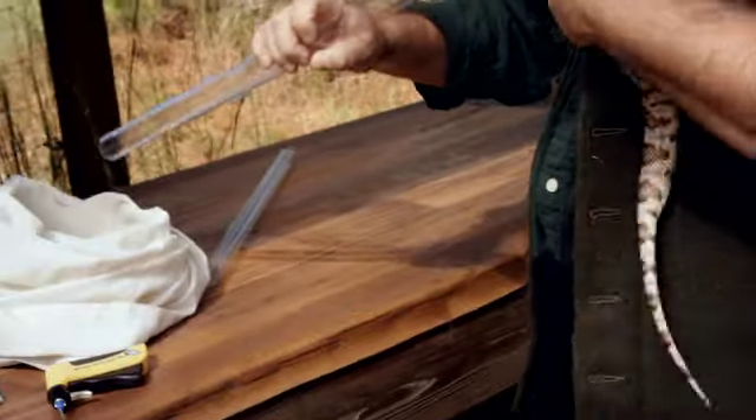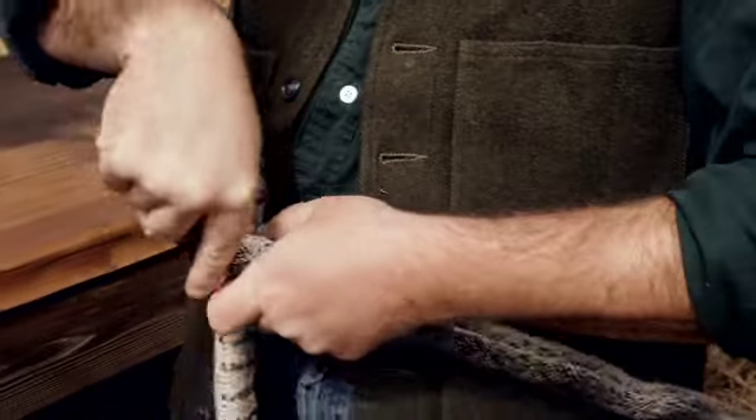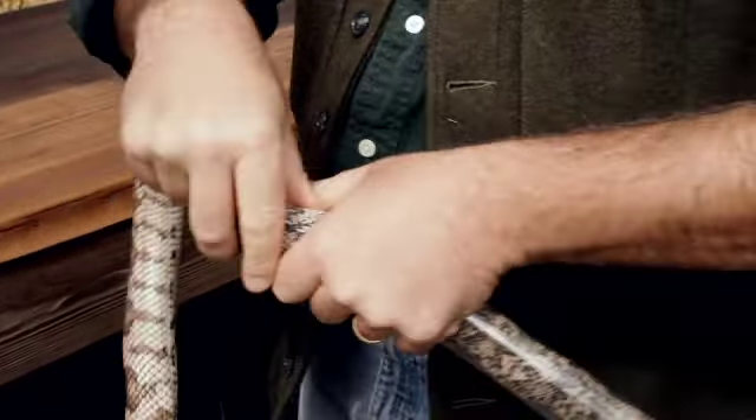So we've got a pine snake here. What I'm going to do is restrain it in a tube, and then I'll show you how we go about injecting this pit tag.